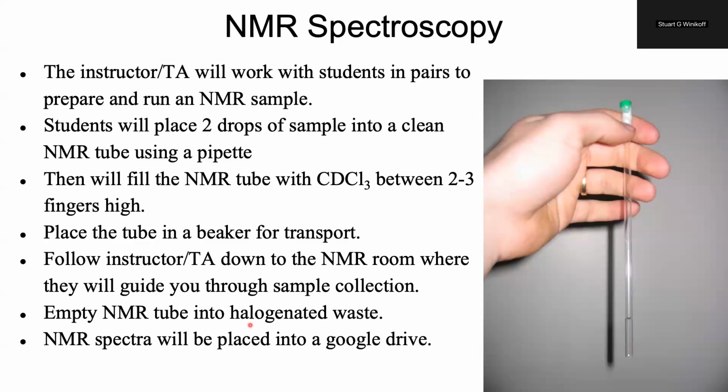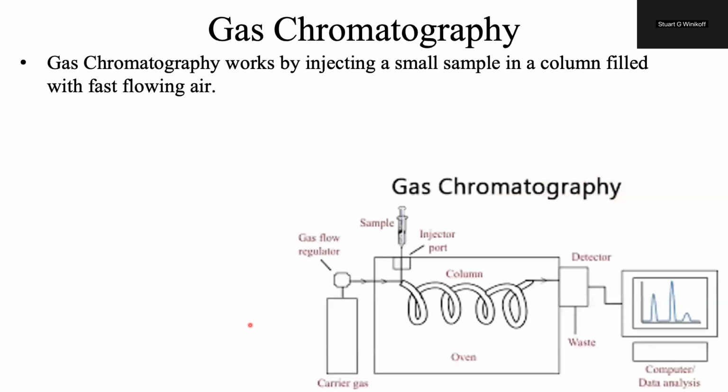And your NMR spectra is going to be saved into a Google Drive, which you can then access later if you need more details.